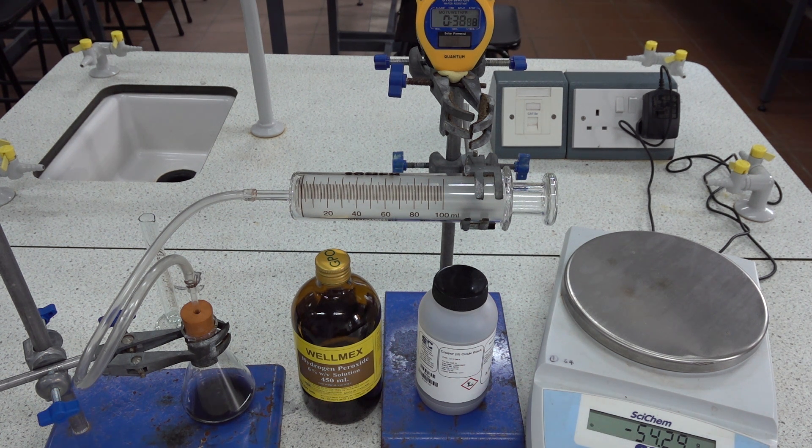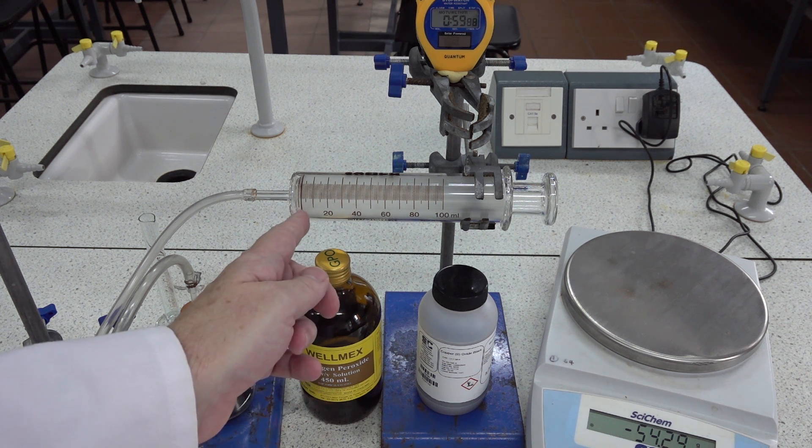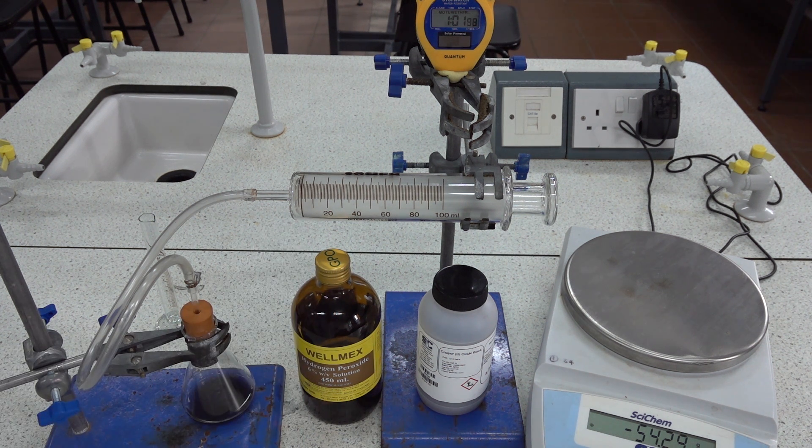Now there doesn't appear to be a whole lot of activity going on in the flask. No appreciable production of oxygen gas and we're certainly not registering any movement on the plunger in the gas syringe. So we'll stop that one after a minute.